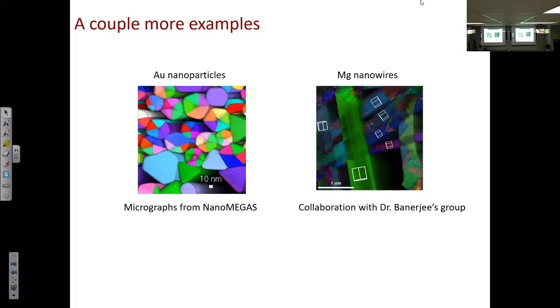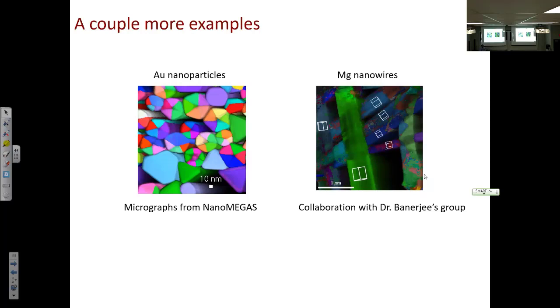Regarding beam-sensitive materials, there are three approaches: first, reduce the beam current by using a large spot size (dimmer beam); second, sacrifice one area for focusing then move to a virgin area for a single scan to minimize beam damage; third, use a cryo TEM holder — available at MIC — which cools the sample to very low temperature, reducing beam sensitivity. You don't need cryo TEM only for biological materials; it works as a cooling holder for any beam-sensitive specimen.